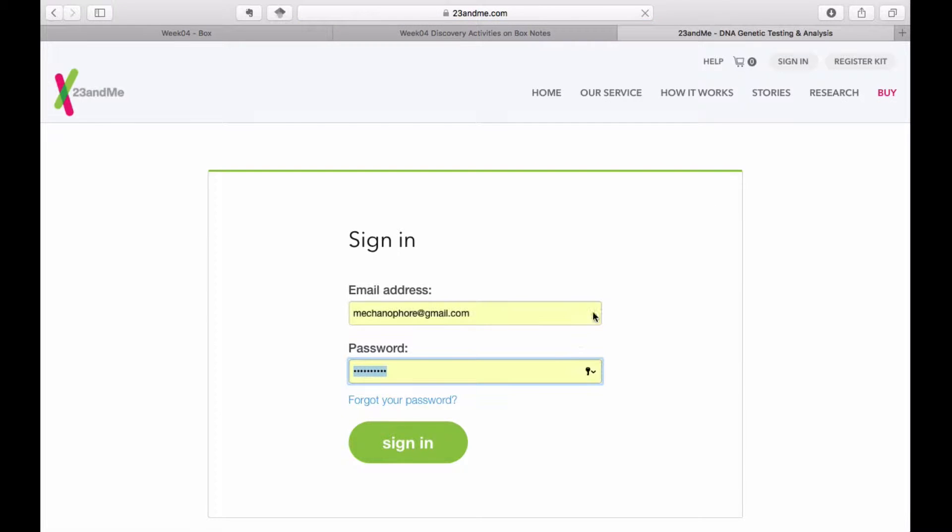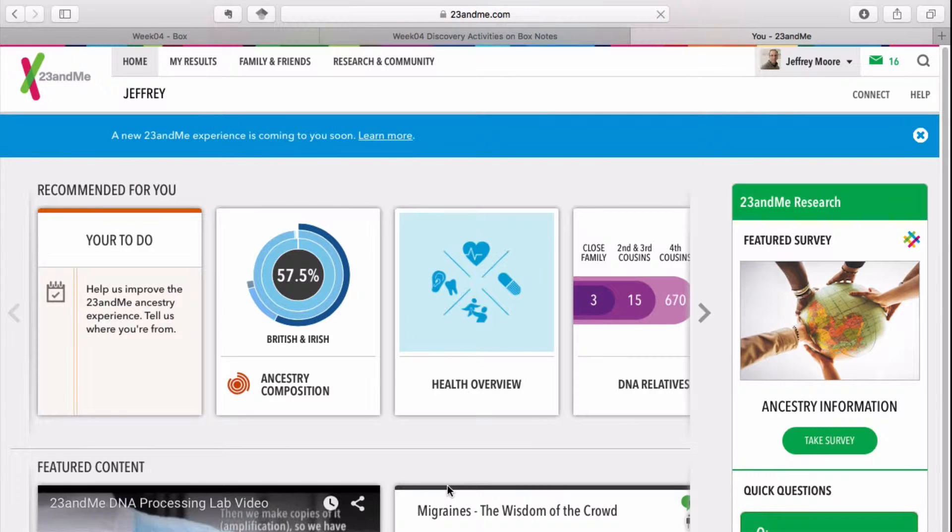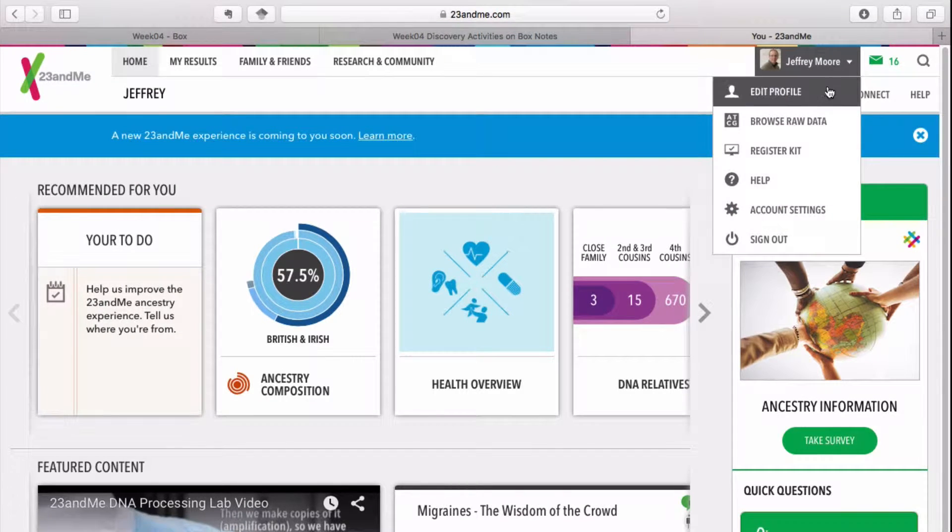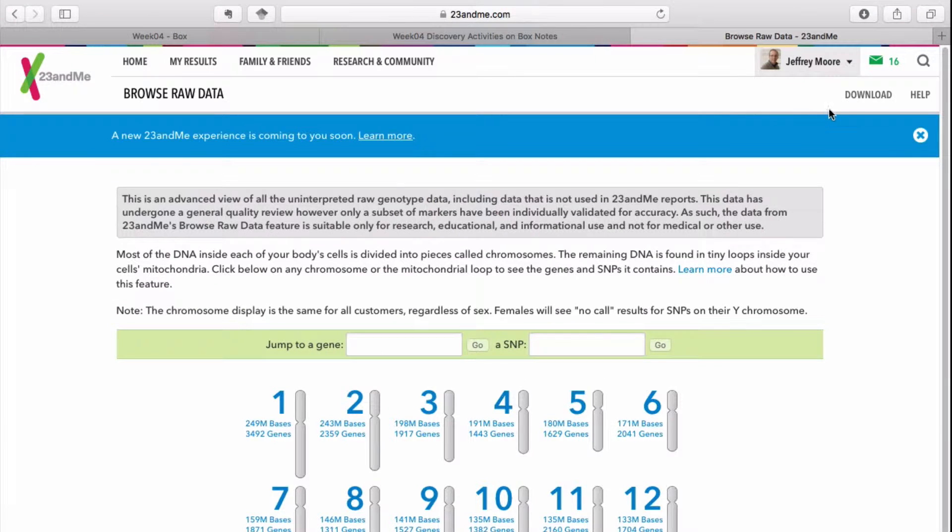Log into your 23andMe account to download your raw data. Click on your account menu and navigate to browse raw data. A download link appears in the upper right corner.